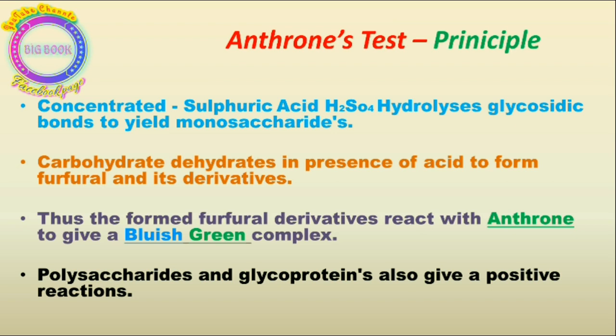The furfural derivatives formed react with anthrone to give a bluish green complex, which is the end result. Polysaccharides and glycoproteins also give a positive reaction.